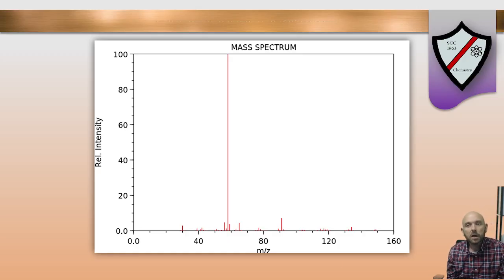Furthermore, because of the way these molecules tend to fragment in patterns, the whole spectrum itself, the different fragments that are produced, are, again, like we saw with the IR, something of a fingerprint. Molecules make unique, reproducible fragmentation patterns in mass spectrometers.